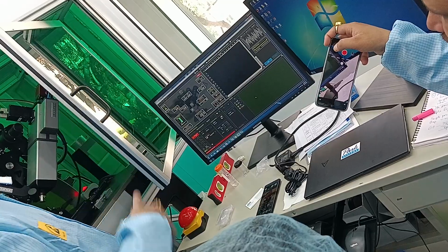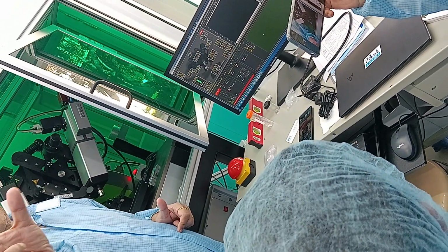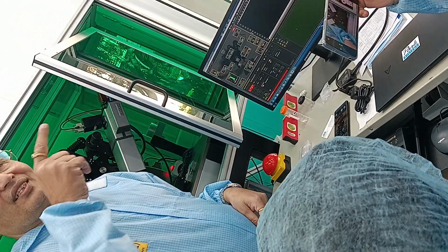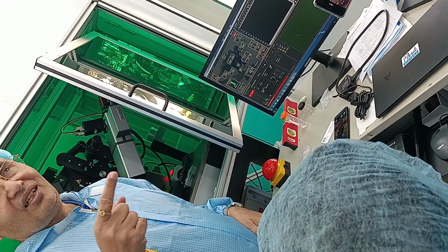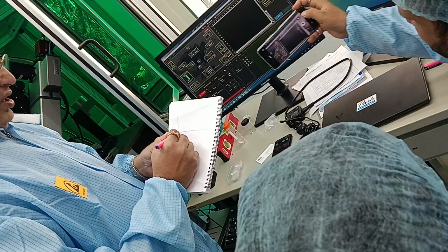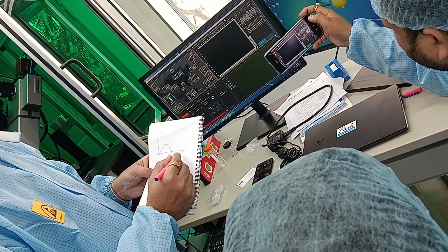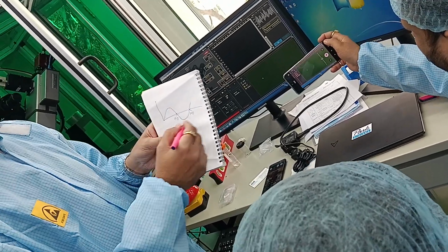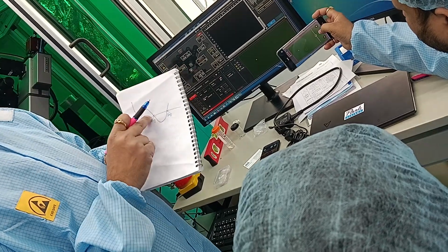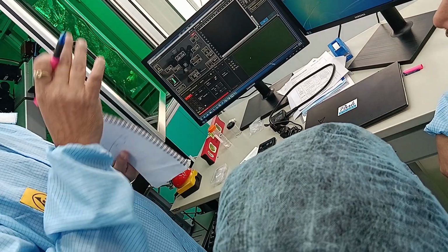For example, to measure a complete wafer. For anisotropic samples, you have two positions of refractive index. That means it will not be a simple n and k. It will be nx, ny, and nz. Kx, ky, kz. It will be these two positions, say 90 and 180. This is the angle at which you are. When light penetrates here, at 90 degrees you have one refractive index, and the refractive index changes and comes to 180 degrees. So there is a shift.